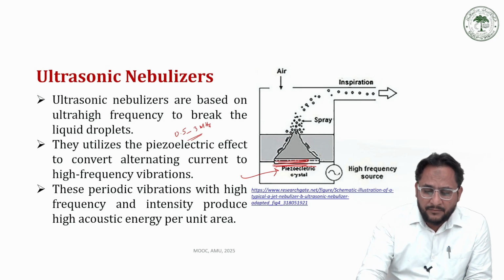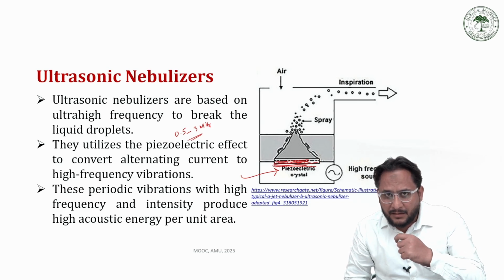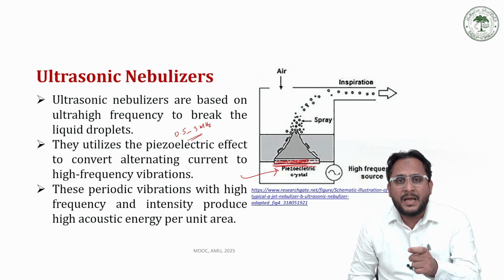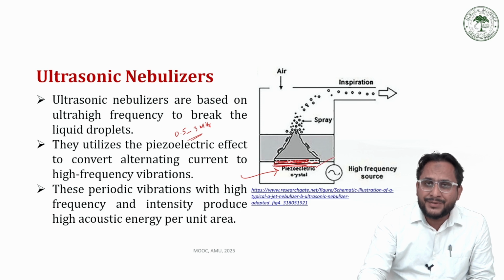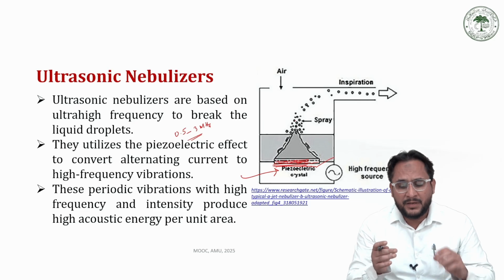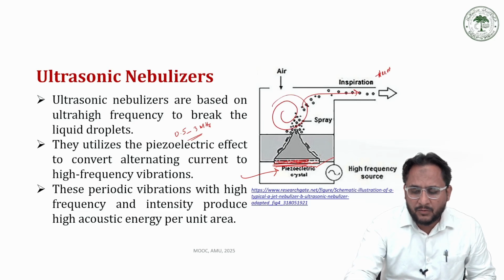So at this high frequency, the crystal creates a force that impacts the liquid sample while air is coming from the top. With the impact created by the vibrations of this piezoelectric crystal at very high frequency, the sample is converted into fine droplets, and these droplets are mixed with air, ultimately forming an aerosol.